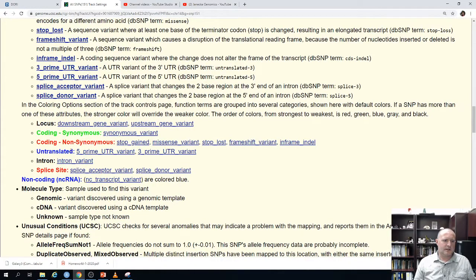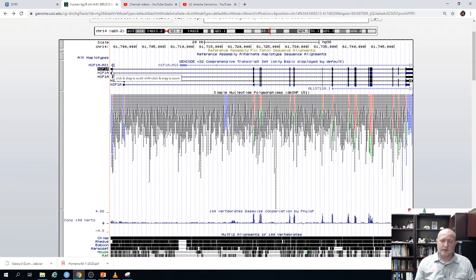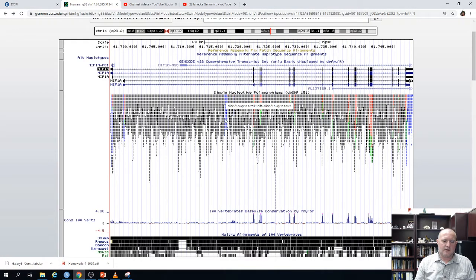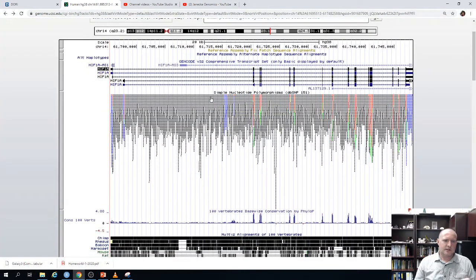Blue means either a SNP in an untranslated region — either 5' or 3' UTR — or a non-coding RNA. Interestingly, if we have blue SNPs in the middle of an intron, and the code says it can also be a non-coding RNA, that tends to suggest there's actually a non-coding RNA transcript inside of an intron. Even in the human genome, there are some mistakes in these annotations, so this is just a potential interpretation.